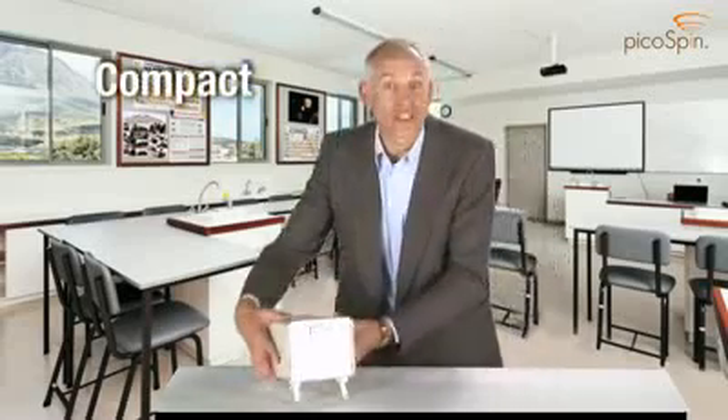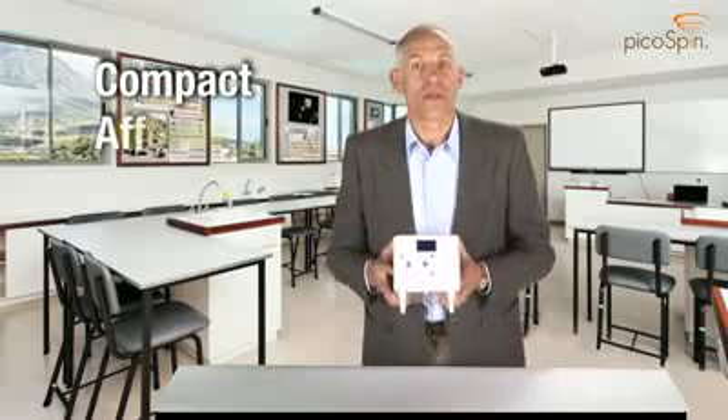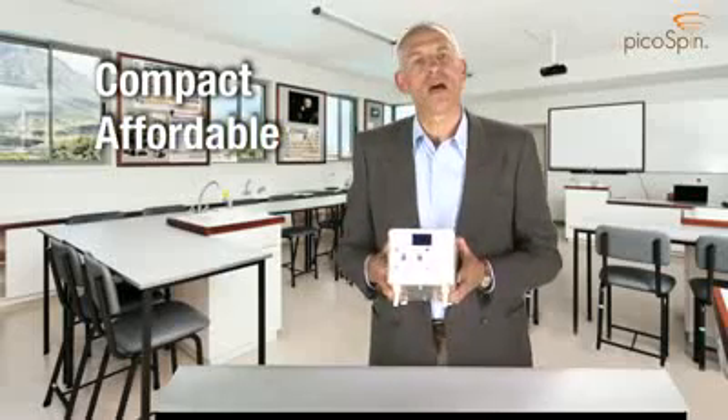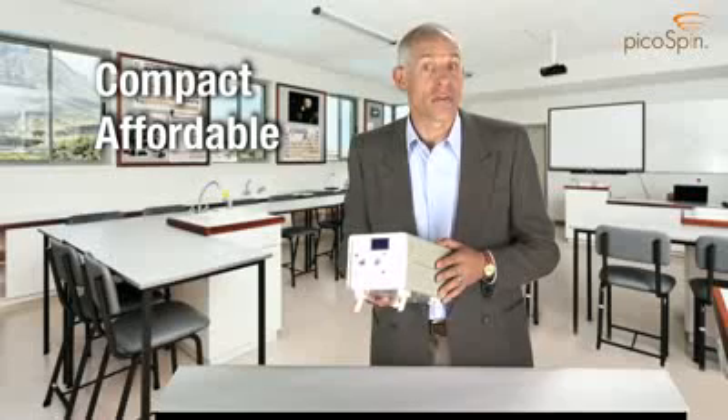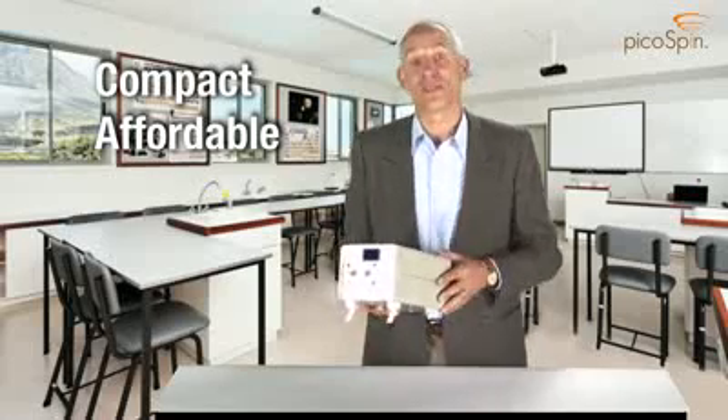First, it's compact. It weighs about 7 pounds, and it's the size of a shoebox. It's affordable — a small fraction of the cost of other NMR spectrometers — and we offer discounts to make the PicoSpin45 even more affordable to educational customers.